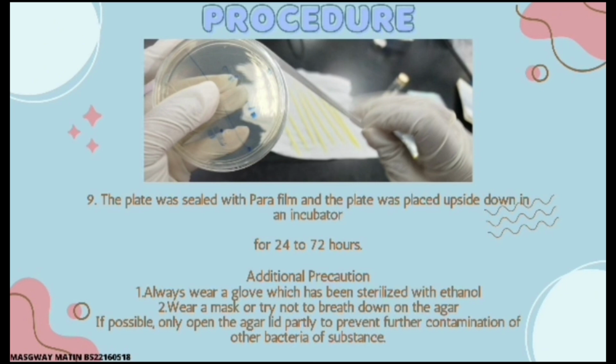Additional precautions are to always wear gloves which have been sterilized with ethanol, wear a mask or try not to breathe down on the agar. If possible, only open the agar lid partially to prevent further contamination by other bacteria or substances.